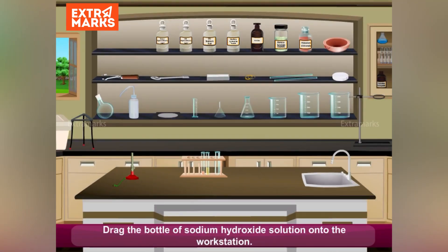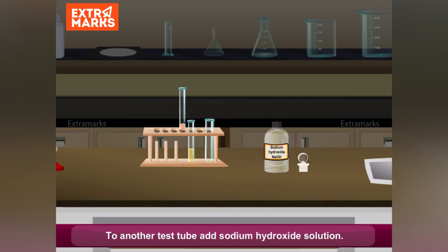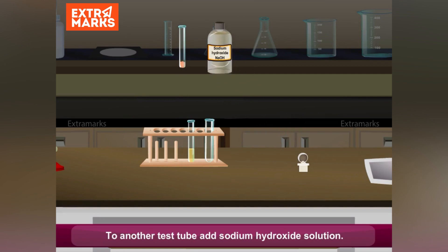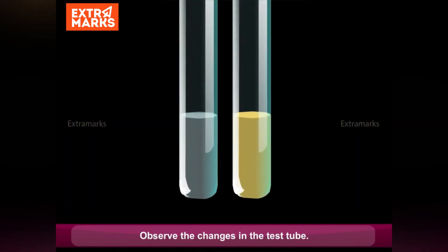Drag the sodium hydroxide solution onto the workstation. Open the lid of the bottle of sodium hydroxide solution. To another test tube, add sodium hydroxide solution. Shake the solution. Observe the changes.